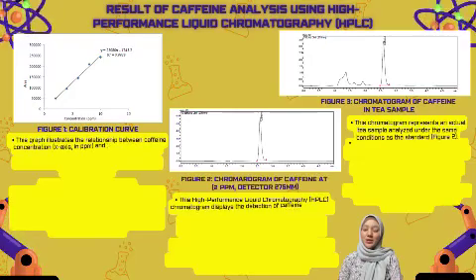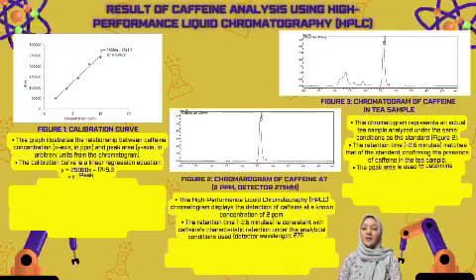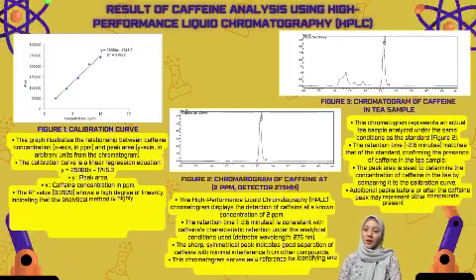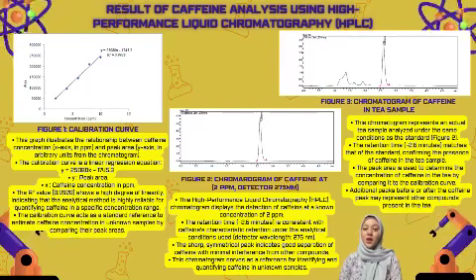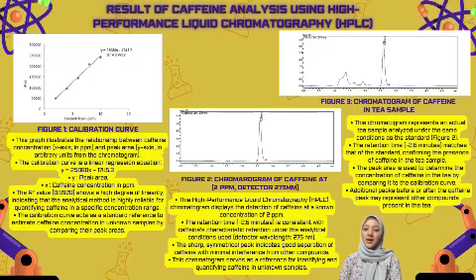Hello, my name is Noizati binti Hassan Basri, and I'll be explaining to you about my study based on the results of caffeine analysis using high performance liquid chromatography, which is also known as HPLC.